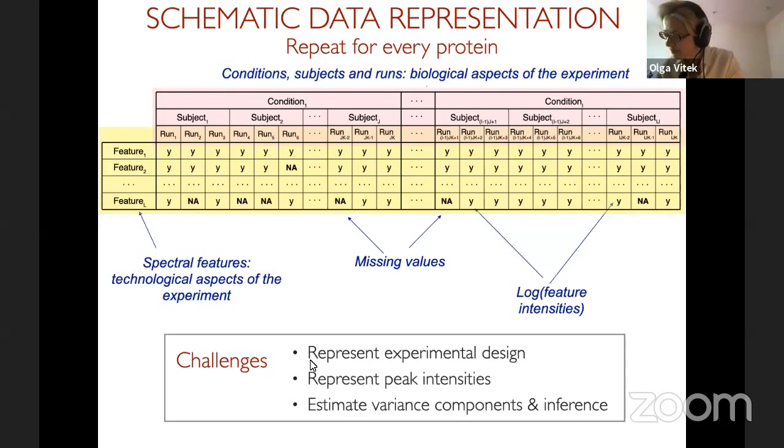Is it possible to calculate abundance through spectral counts in MSstats? Not really. The reason is that spectral counts are count data, and we assume that the data are peak intensities. So this is really designed for intensity data. You would need different statistical models to work with count data.